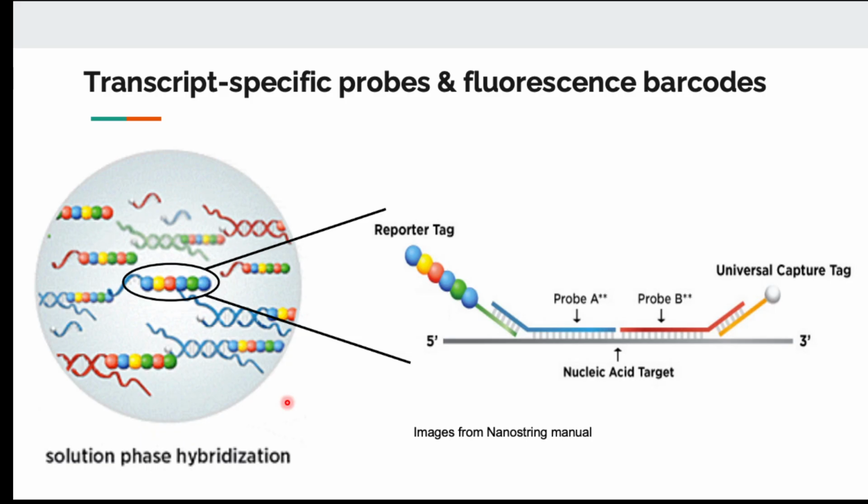So basically, we want to have a very accurate measurement of gene expression. Like we mentioned that microarray is not that accurate because the hybridization and the fluorescent signal sometimes doesn't scale all the way, right? Sometimes it's saturated. And when we do sequencing, like we mentioned from before, we got the read count. The read count can be affected by PCR amplification. It can be affected by other bias.